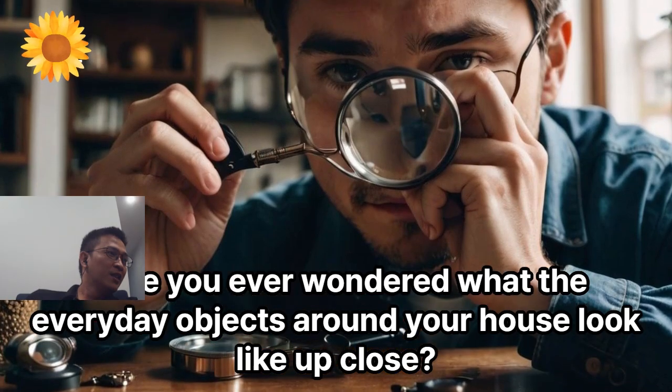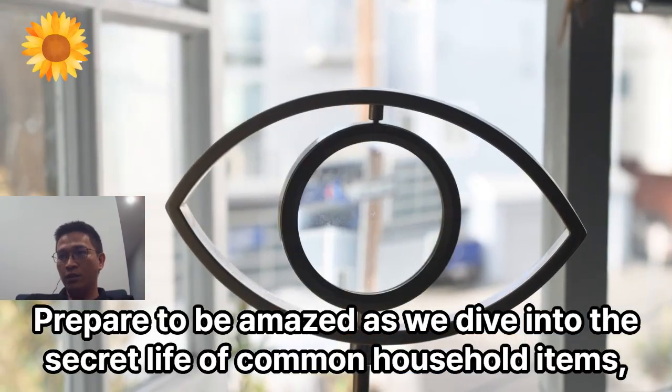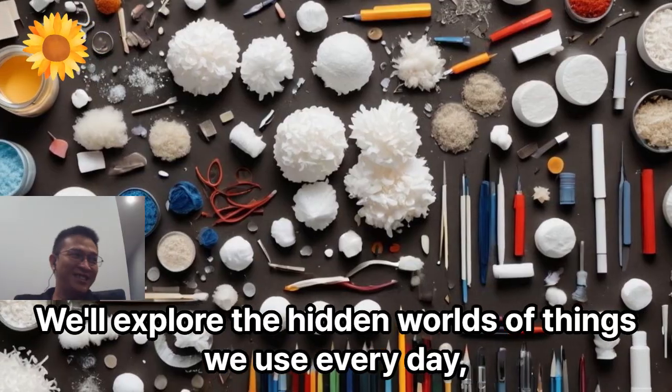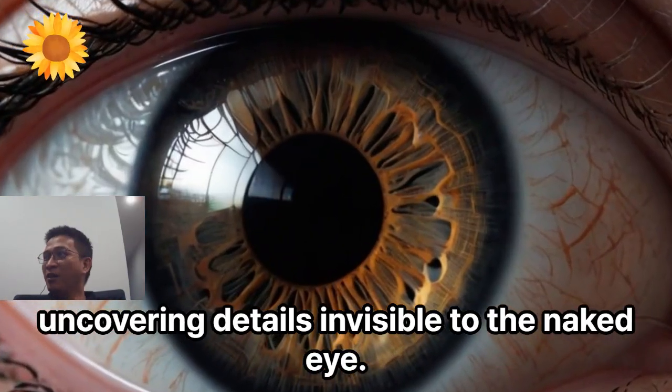Have you ever wondered what the everyday objects around your house look like up close? Prepare to be amazed as we dive into the secret life of common household items, all revealed under the microscope. We'll explore the hidden worlds of things we use every day, uncovering details invisible to the naked eye.